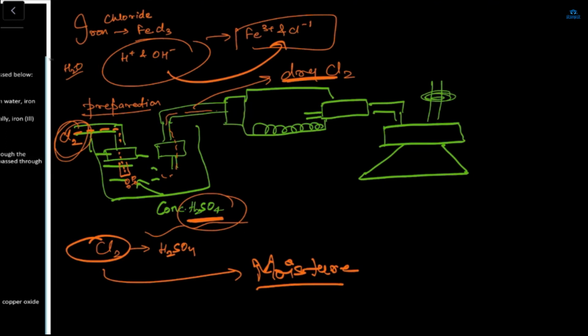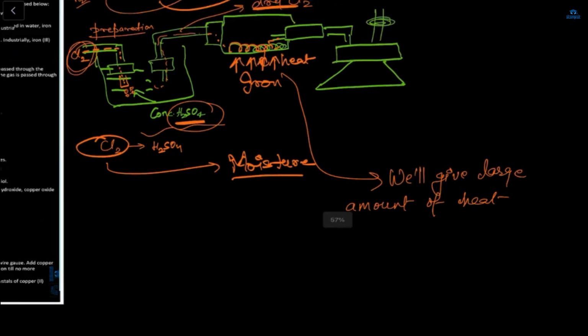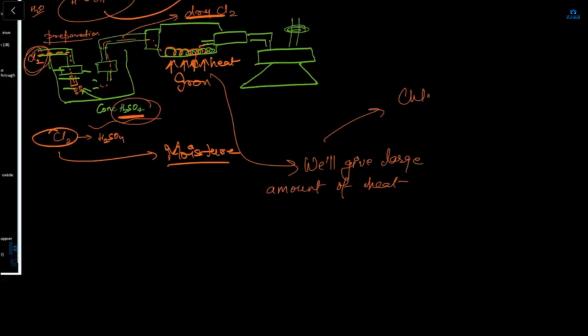Then dry chlorine will pass through iron wire. This is your iron. Your dry chlorine will pass through the iron wire, and when it heats, we will give a large amount of heat. Then what will happen? Chlorine and iron. So first of all, your chlorine is full of moisture. After removing moisture in this pipeline, your dry chlorine is there. So this dry chlorine will pass through iron. If in this chamber we give a large amount of heat, then your chlorine and iron will react.